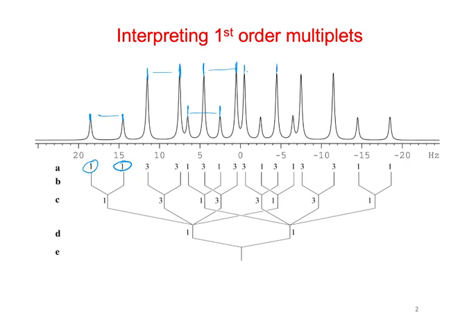And the same on this other side. So all of these splittings are arising from a single doublet. Okay? And if we wanted to measure what the coupling constant was, these are in hertz, we would just estimate, or we'd get a number from these values, and we just subtract to get the size of the doublet.